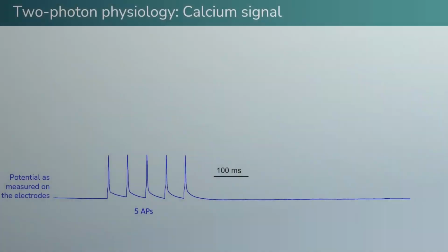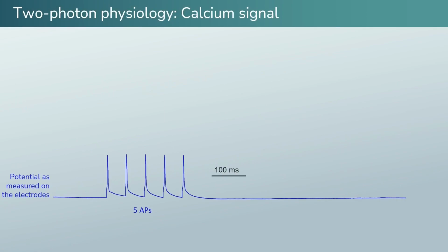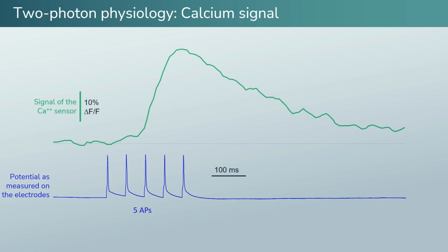At the same time, we do know that the activity that we see here, calcium activity, has a murky relationship with the electrical activities of the cells that traditionally are regarded as the per se activity of the cells. As an in vitro example, here you see the intracellularly recorded traces of 5 evoked action potentials, and here their calcium signal counterpart. The relationship is apparent, but there is some lag, and the temporal resolution is far from revealing the underlying individual spikes.